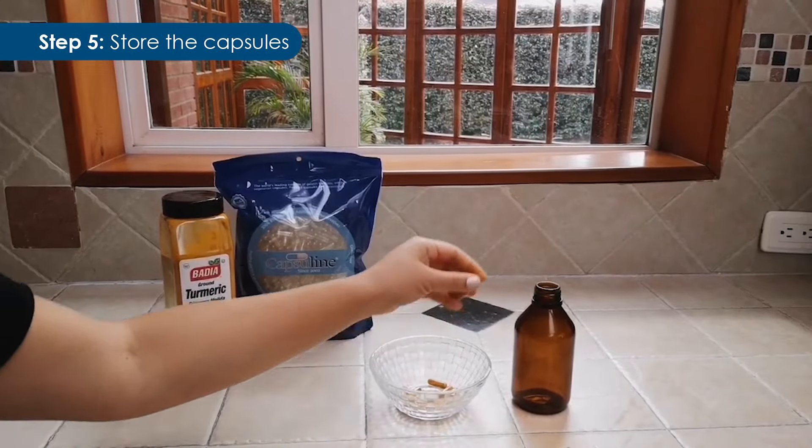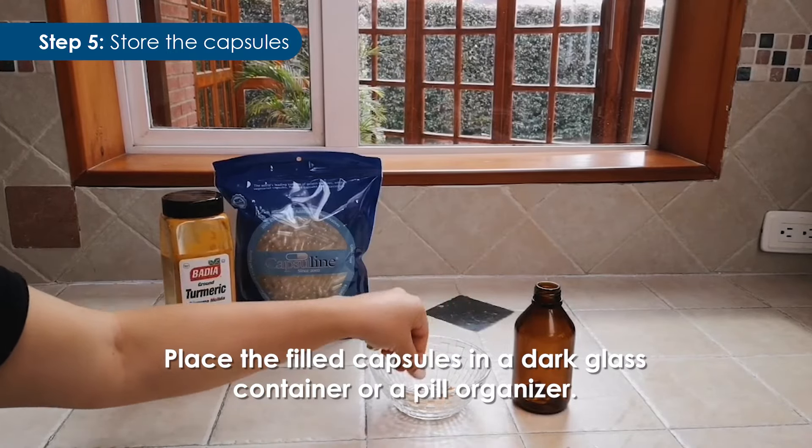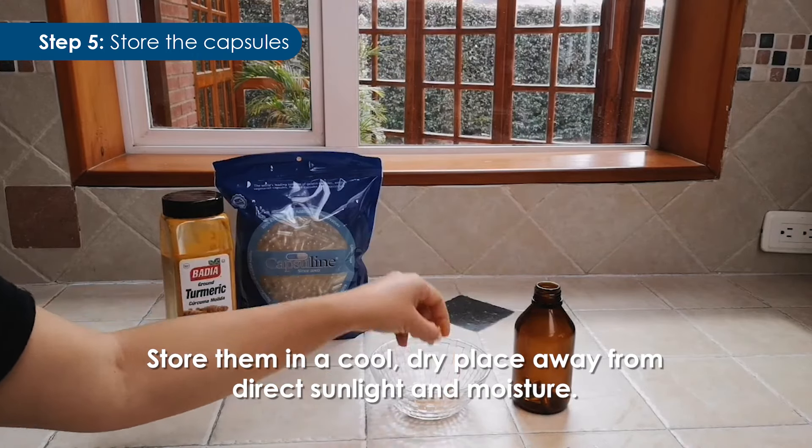Step 5: Store the capsules. Place the filled capsules in a dark glass container or a pill organizer. Store them in a cool, dry place away from direct sunlight and moisture.